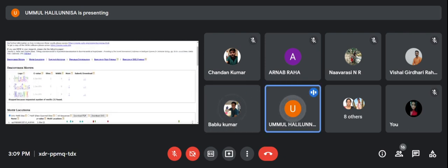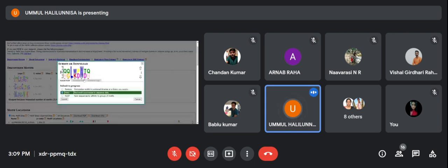Here we got one motif region, right? Can you see the motif region? Yes, ma'am. Here I want to find out for this. I'm choosing this motif as my priority, so I want to find out whether a similar kind of motif is present or not. Here I'm choosing two or three things: find similar motifs published in libraries or a library you supply, or find motif occurrences in sequence data, and rank sequences by affinity groups of motifs.